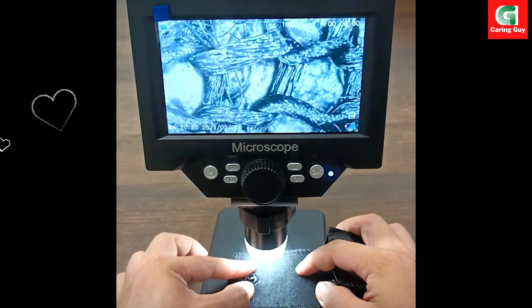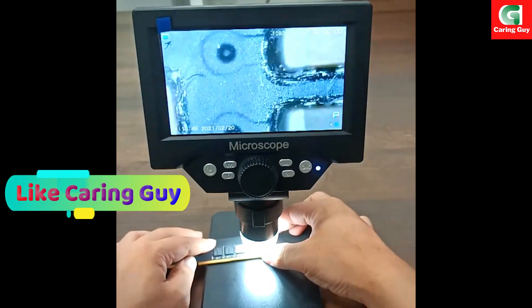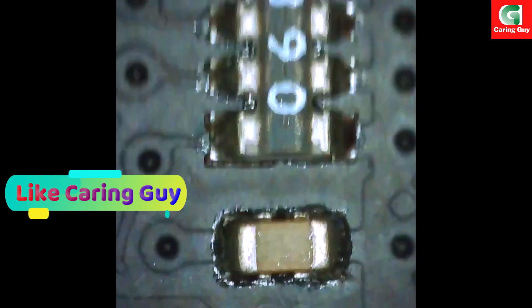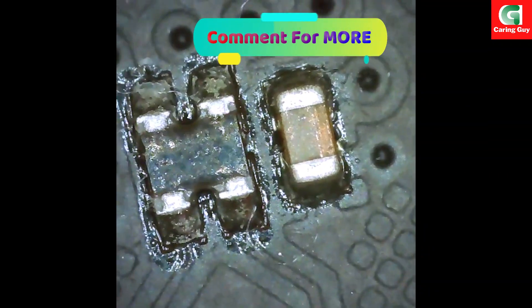Supporting Windows connection, the microscope allows users to observe on a larger scale. Users can utilize the AmCap software for Windows and ensure compatibility with macOS by using Photo Booth on MacBook.